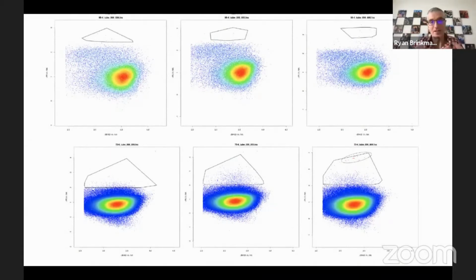Here's another example that I didn't think we were able to pull off, but if you spend the time to parameterize these algorithms, this is one population here in this tetramer data. It only shows up in certain cases, and we had some test data that we knew what those were. But the algorithm doesn't know if those populations are going to be there or not. We have to set this algorithm up to say, well, if there's this population here, gate it. And then a new data set comes up and has to look, well, this is what one set of data looks like where there's not that population. There's no information that tells the algorithm that it's there or not, but we never gated it when it wasn't there, when we had the gold standard, when we knew that it was there or not.